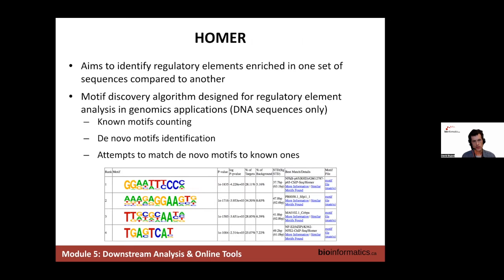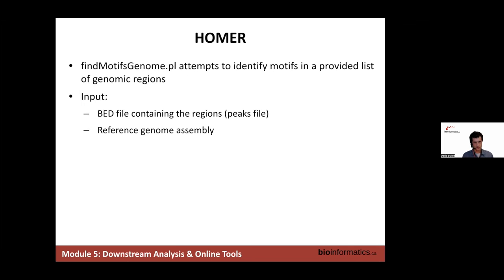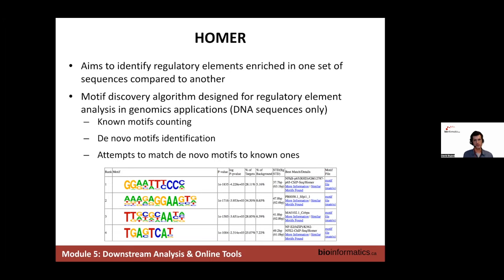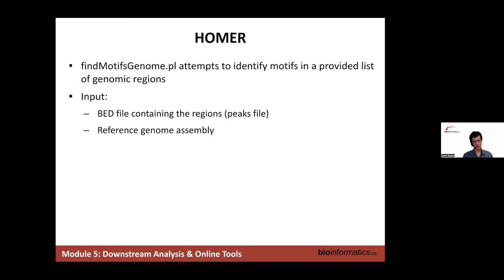For motif detection we'll use Homer, a command-line tool running on your AWS instance. The goal of Homer is to identify regulatory elements enriched in one set of sequences compared to another. It has its own database to identify known motifs and can also identify de novo motifs. The specific tool we will use is findMotifsGenome, with two inputs: a BED file containing the regions of interest — the peak file — and the reference genome assembly.